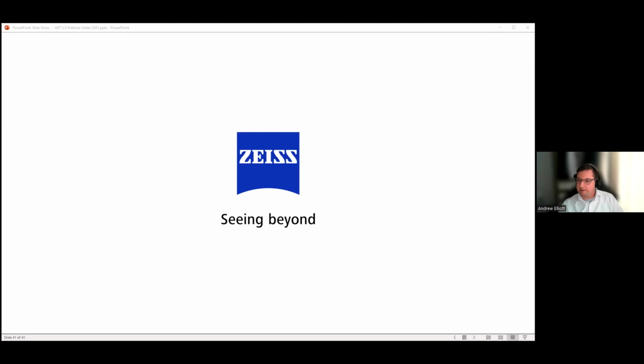Okay, so next question from Matt Divers. And with DeepScale, are you training based on projection data or reconstructed data? Again, a very good question that I should have made more clear in the slides. So what you have for DeepScale is reconstructed data sets to begin with. So you'll have a high resolution reconstructed data set and a low resolution, and you feed those into the model, it trains the model, and then you can use that to apply to the different areas that are in your sample.